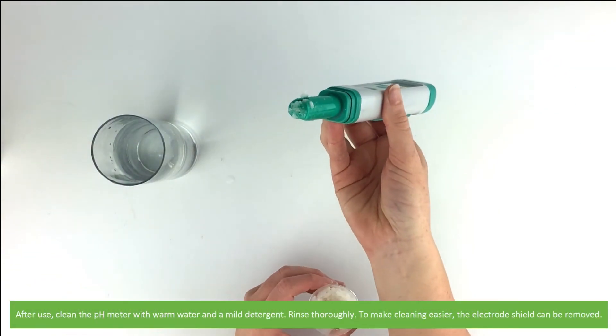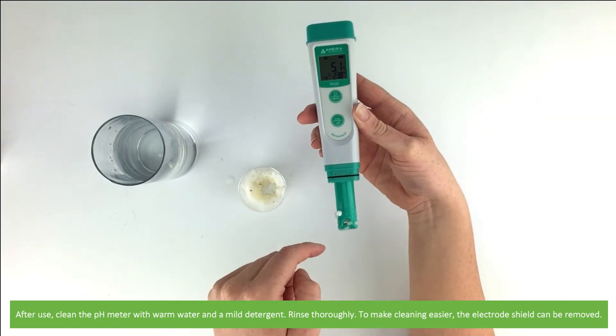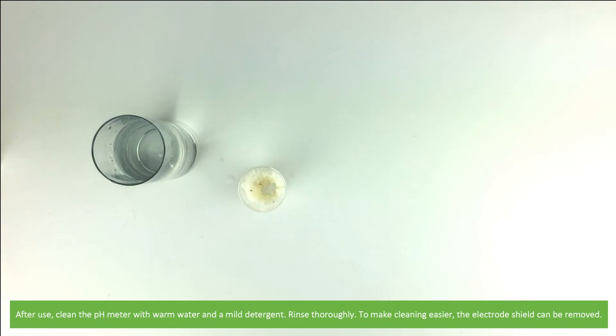After use, clean the pH meter with warm water and a mild detergent. Rinse thoroughly. To make cleaning easier, the electrode shield can be removed.